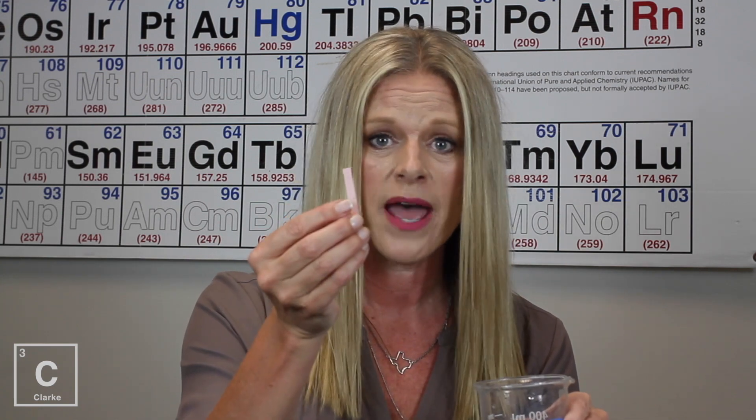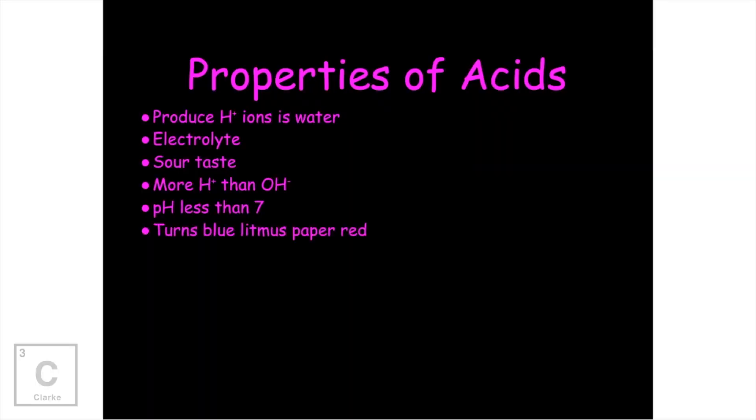But if we use red litmus paper, nothing's going to happen. So red litmus paper stays red. Blue litmus paper turns red.